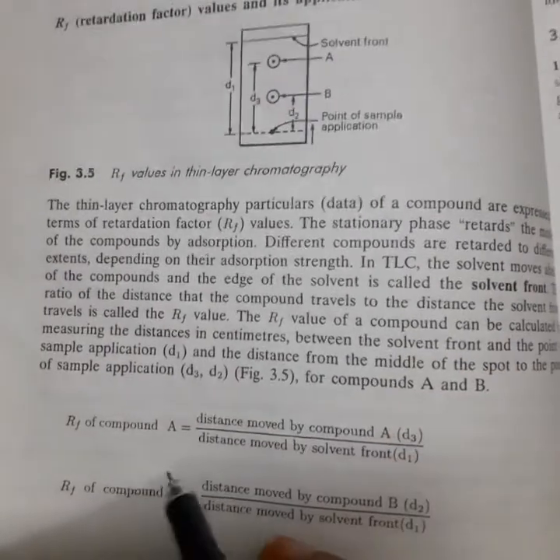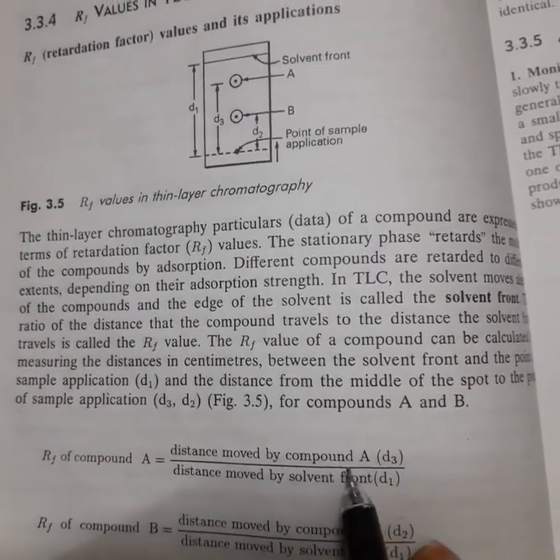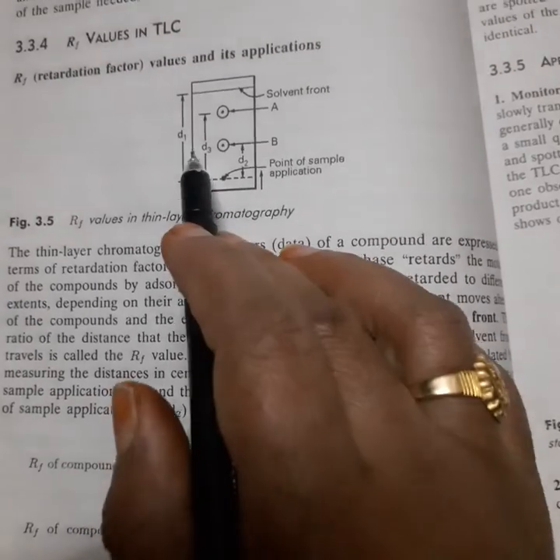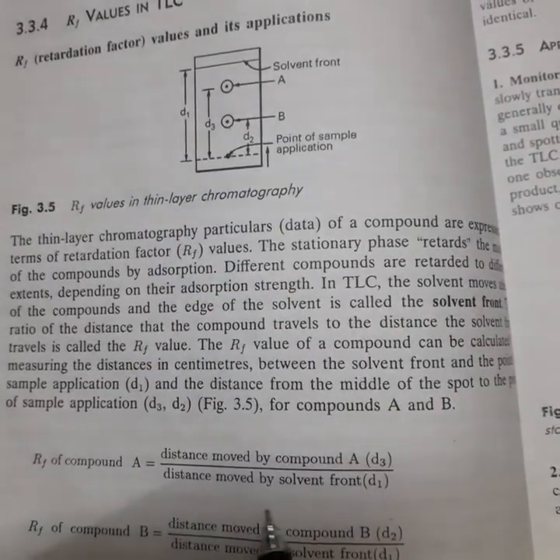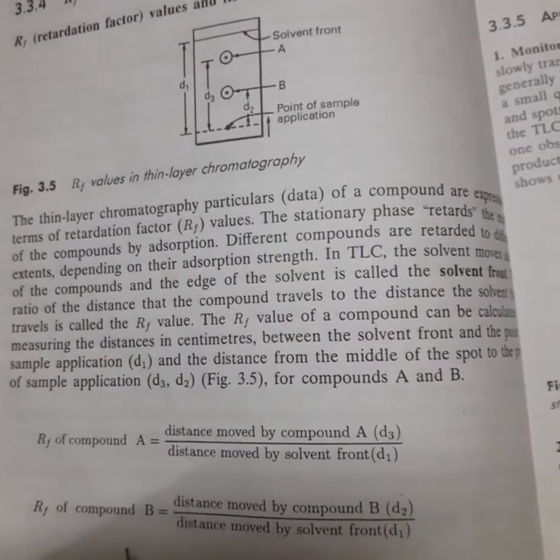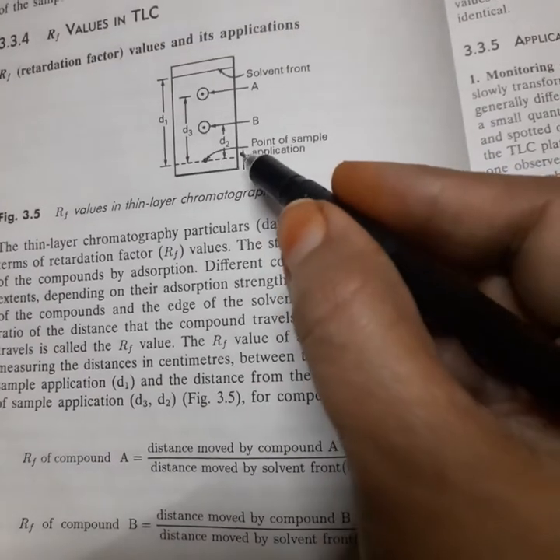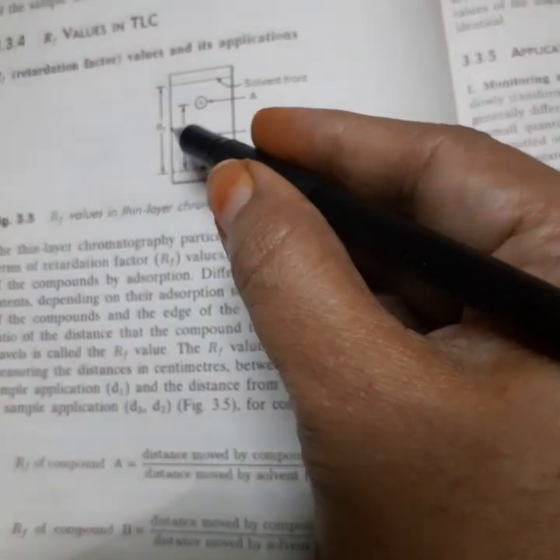So RF value of A, how can I find it? RF value of A is equal to the distance moved by the compound, that is D3, by the distance moved by the solvent front, that is D1. RF of compound B is the distance moved by compound B, that is D2, by the distance moved by the solvent front, that is D1.